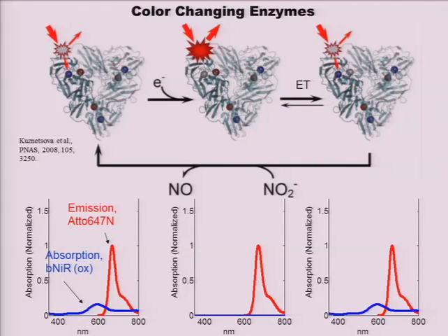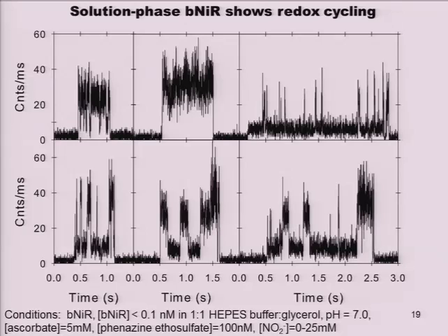So Leandro arrived at Stanford. We worked together for a week, and then I spent the next bunch of months actually learning how to do this experiment properly. So here's what we saw. All right, we put these NIR molecules into the ABEL Trap, and again we see fluctuations. But we don't see fluctuations from several unique states. What we see are fluctuations between basically two plateaus, a high state, a low state, both distinguishable from background.